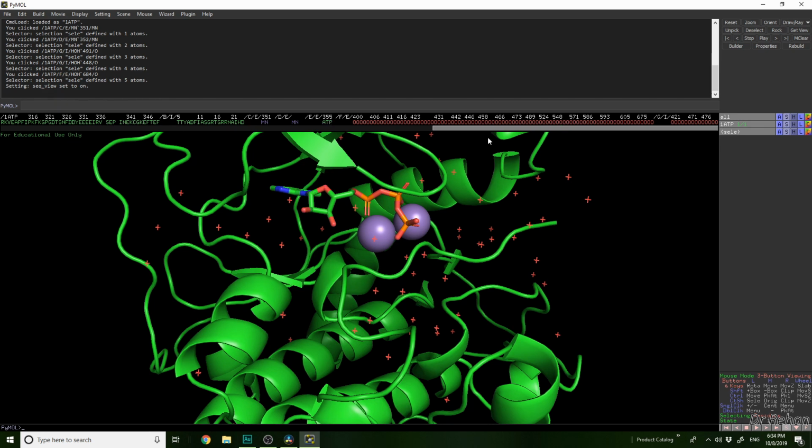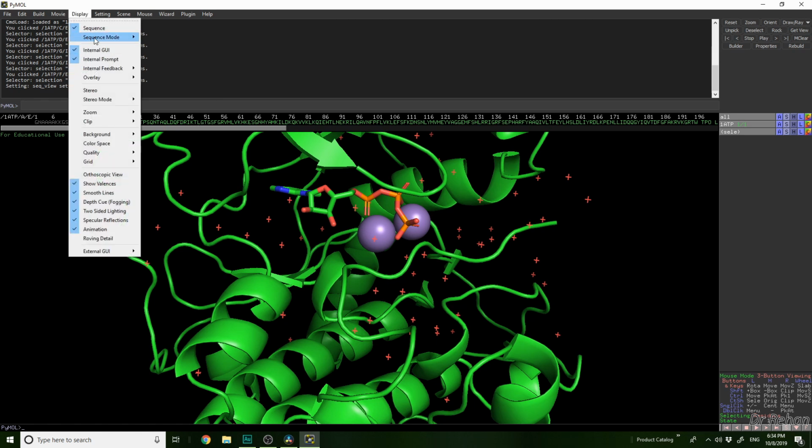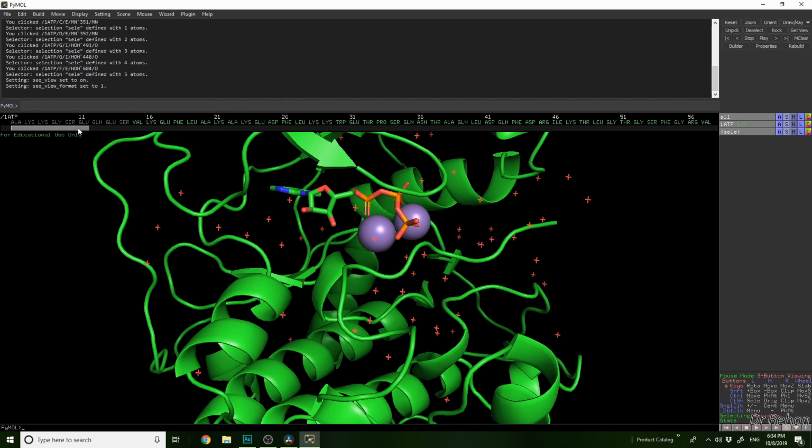These are the residues which are given in the 1-letter code, and you can even display the residue names, which are represented by 3-letter codes. And we are interested in doing mutagenesis somewhere in this protein. So I will take the 26th number phenylalanine residue and will change it to alanine.